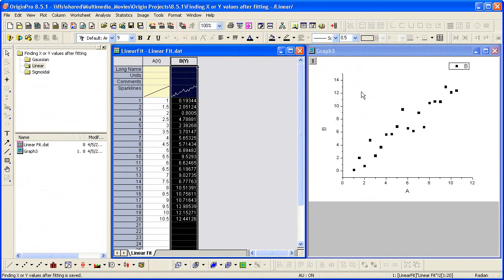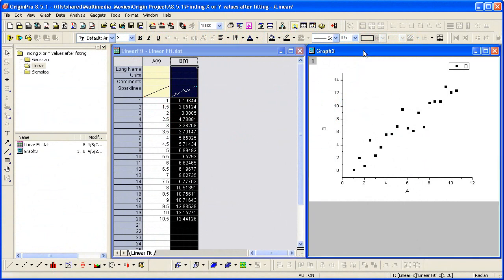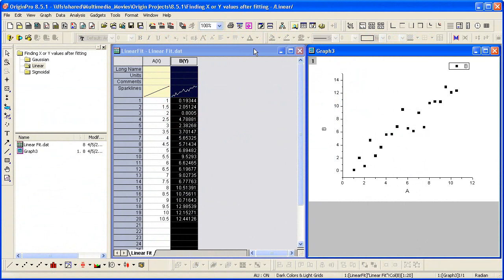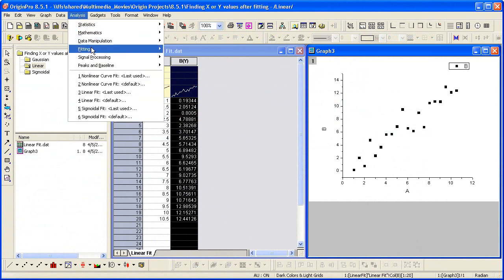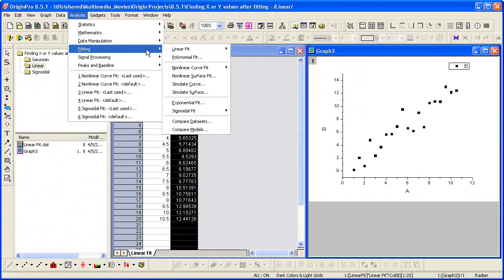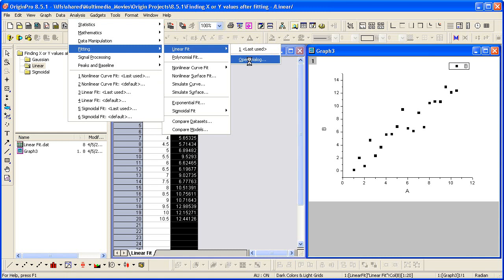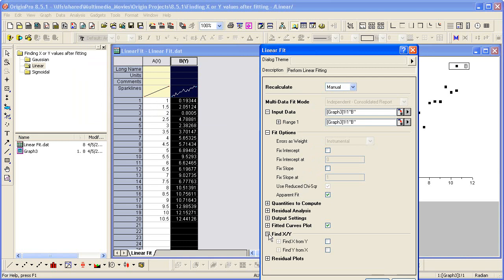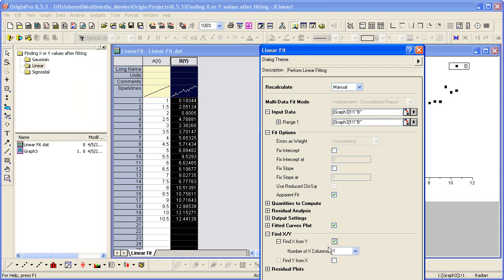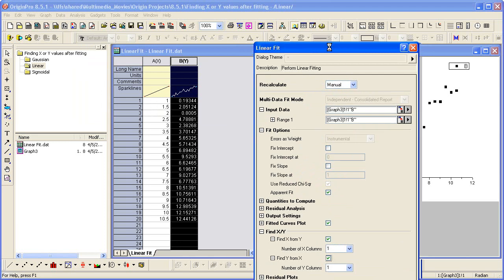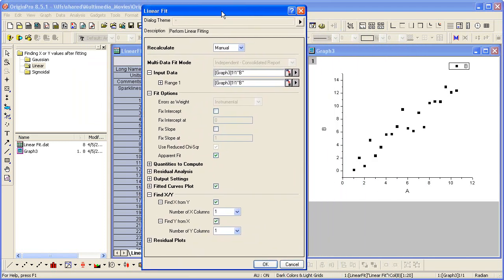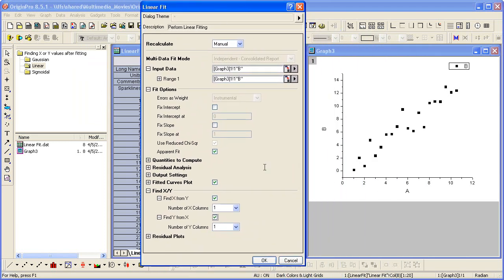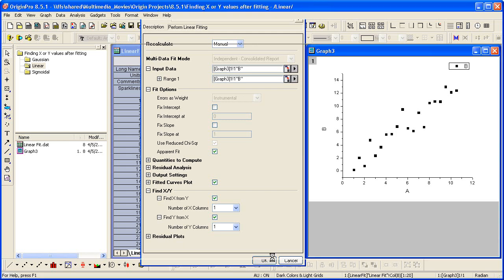Let's begin by fitting this linear data. To do that, I make the graph active and select analysis fitting linear fit. The input data has automatically been assigned as the active data plot. I'm going to go ahead and leave the default settings in the dialog. I just simply need to enable the Find X, Find Y feature here by clicking these checkboxes. Click OK to perform the fit.